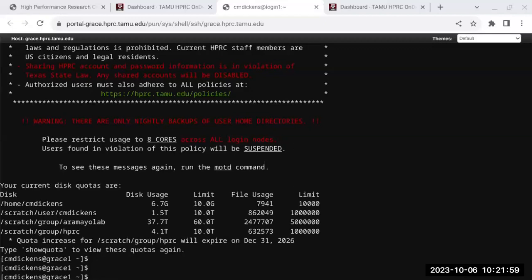So for example, this first part of the string here is identifying the flow cell ID and the coordinates on the flow cell. And then you have this number one, that's read number one, and then read number two. And this is all the same because it's the same sequencer and the same coordinates.